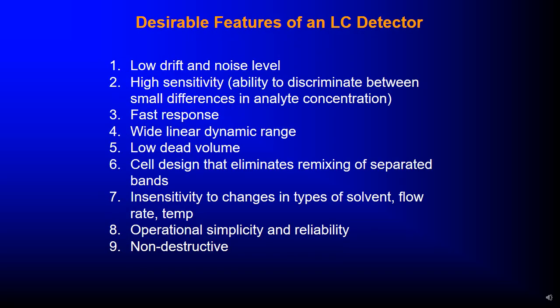Desirable features of a liquid chromatography detector: one, it has to have low drift and noise level, high sensitivity, fast response, wide linear dynamic range, low dead volume, cell design that eliminates remixing of separated bands, insensitivity to changes in type of solvent, flow rate, temperature, operational simplicity and reliability, and non-destructive. It has to be non-destructive.